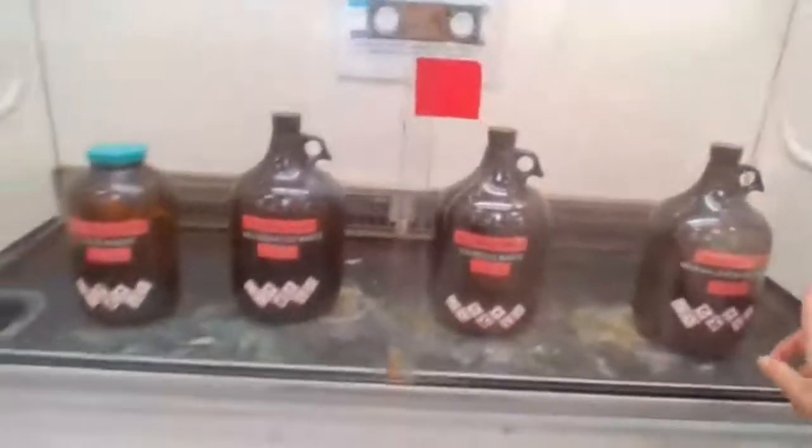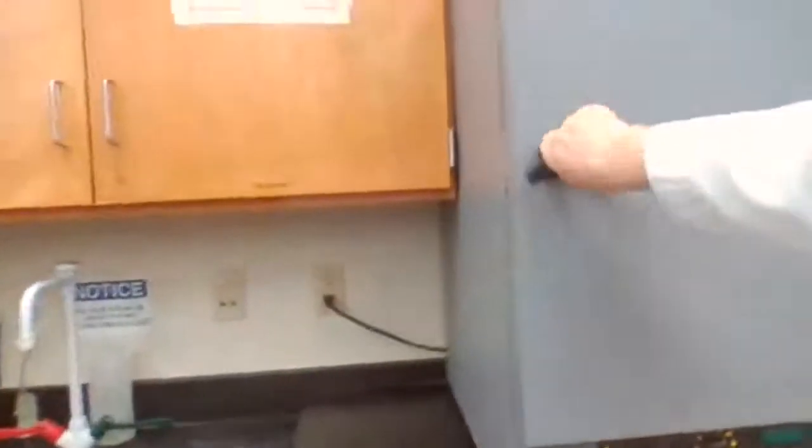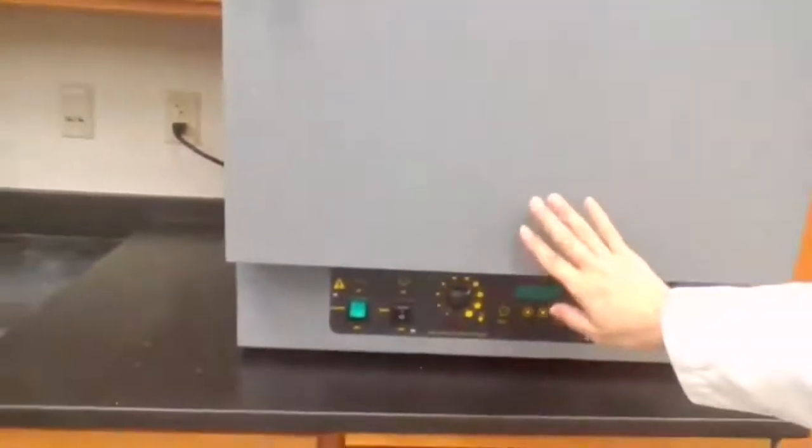Non-halogenated doesn't contain halogens. We have the oven, two of these ovens, and this one is set at high temperature now, the boiling point of the solvent. And after the 5 minutes is over, I bring it and I place it in the oven. It's been turned on.